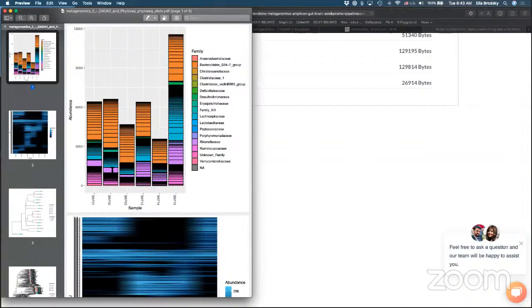So you can see in the results, let's think, what are these results? What do they actually mean? Here you have samples BKF01, 02, and 03, as well as 13, 14, and 15. These are high-fat diet, and these are chow, regular diet.